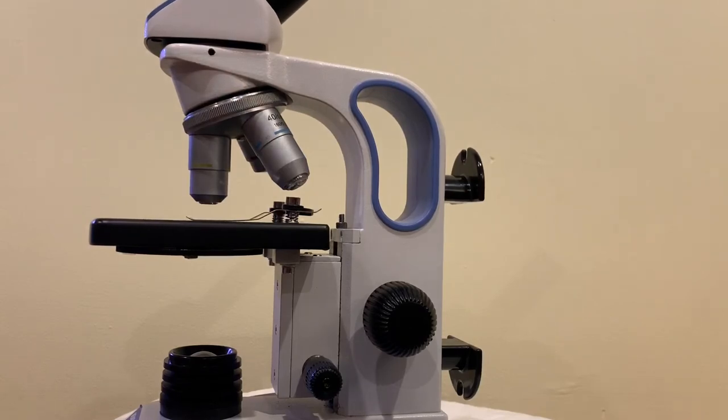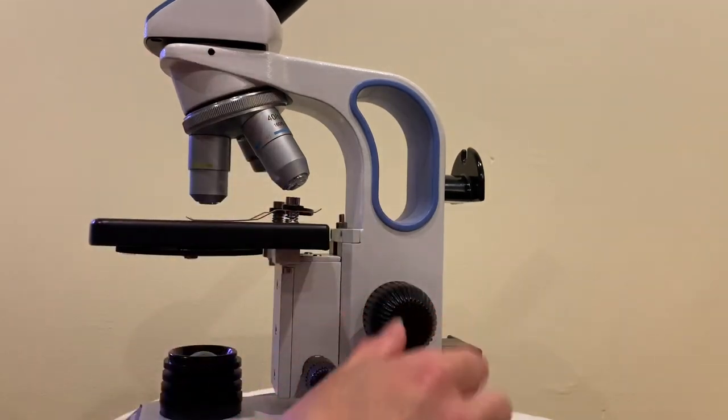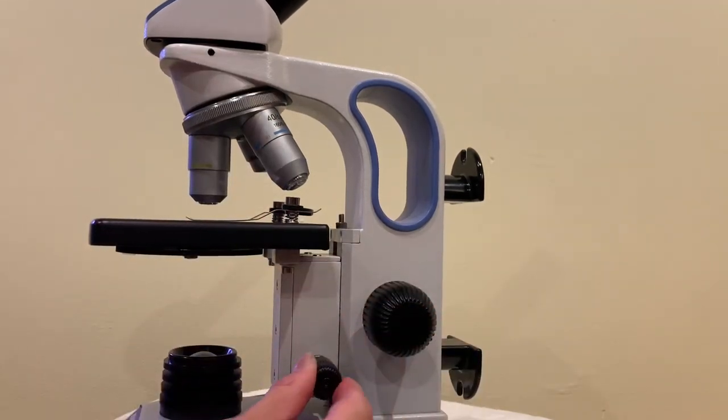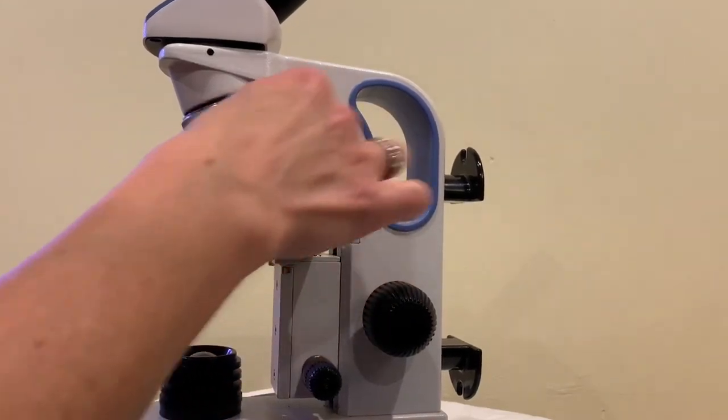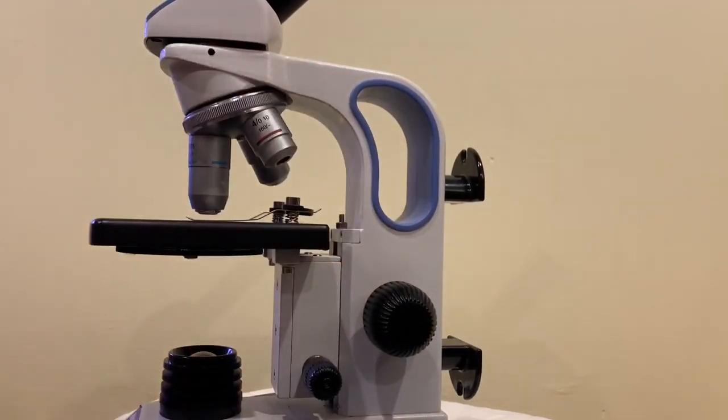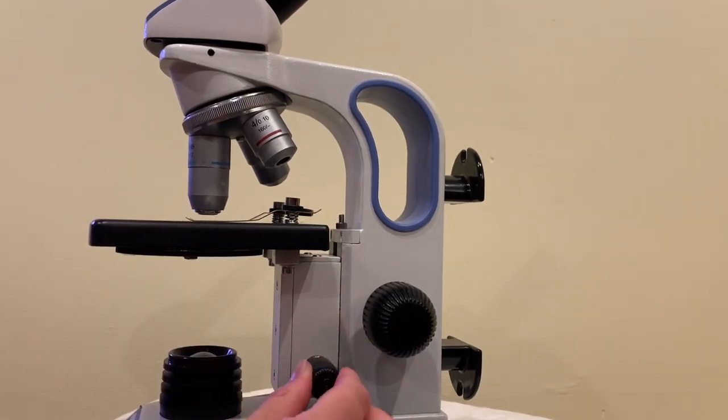Do you see how I didn't lower the stage in between? Don't do that either. Okay? And then you'll use the fine adjustment knob. Bring it into focus. And then last but not least we'll turn it to the highest objective lens and then once again fine tune your focus here.